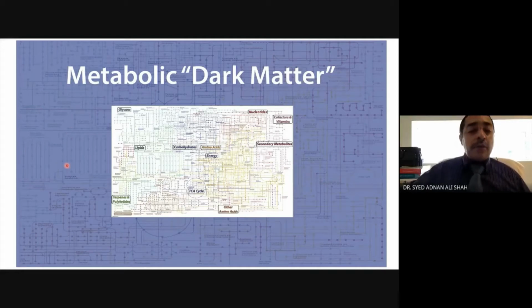in order to find the metabolic pathways of formation of different types of metabolites, and what metabolites are produced by different species of plants, different fungi, or different media. For example, different diseases have different types of metabolites as compared to a healthy person. So this spectroscopic technique can help to resolve this dark matter.